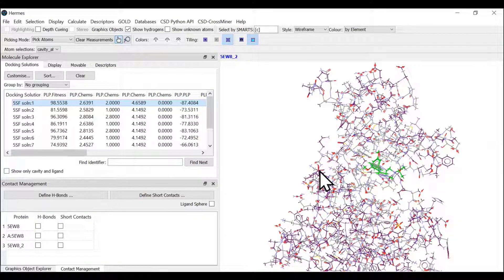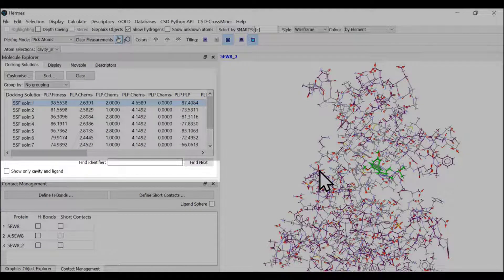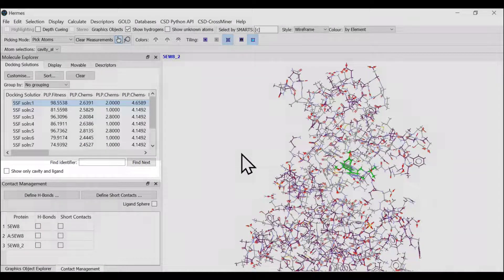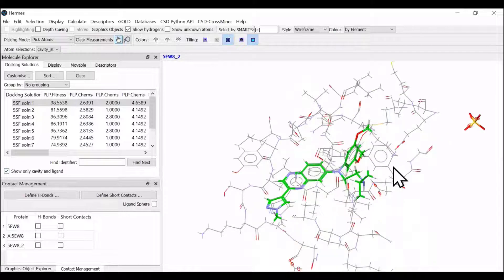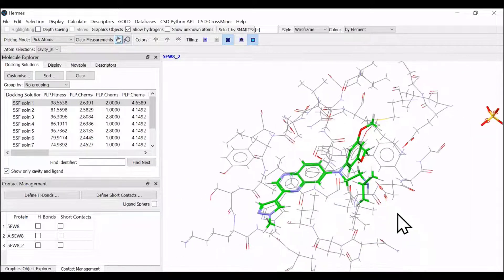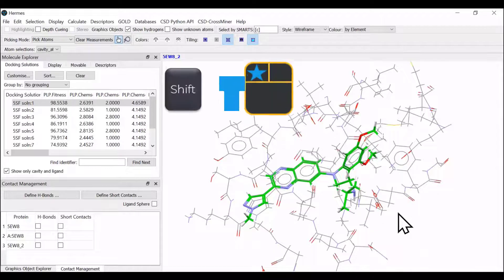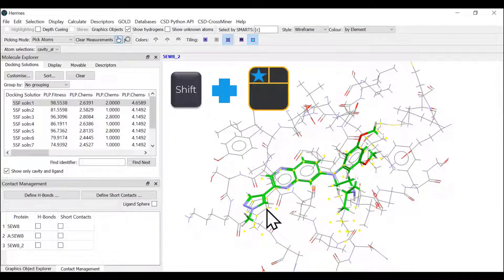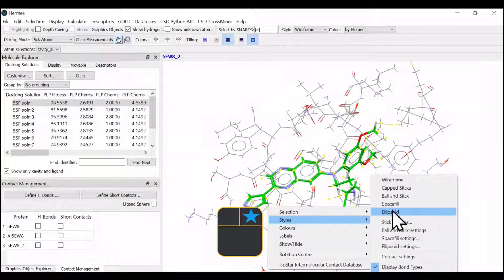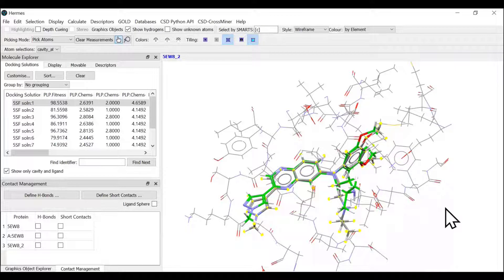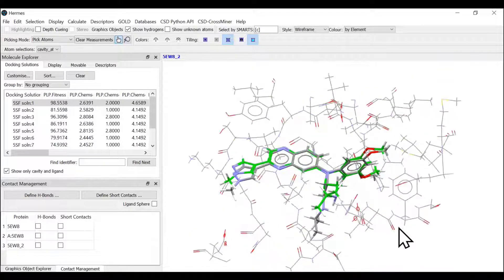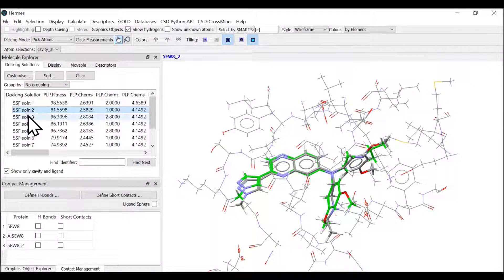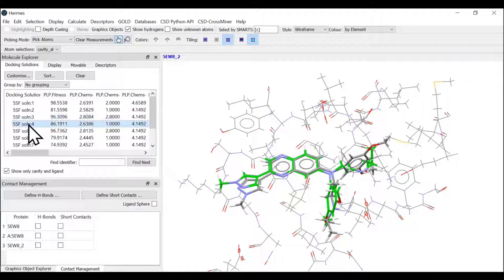We have a nice function of only looking into the cavity and the ligand so we can focus on the region which we are interested in. You can use shift and click mouse button to select the molecule and change the style to cap sticks. You can see the reference ligand and our docked solution. We can see solution number two, then solution number three, four, and so on.